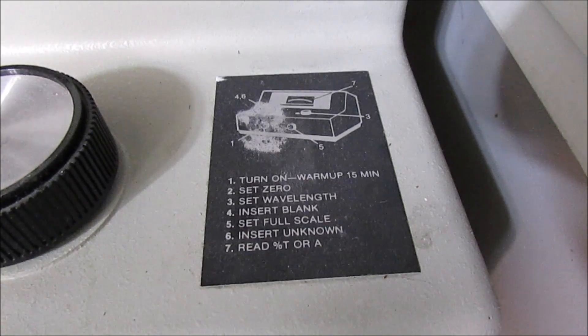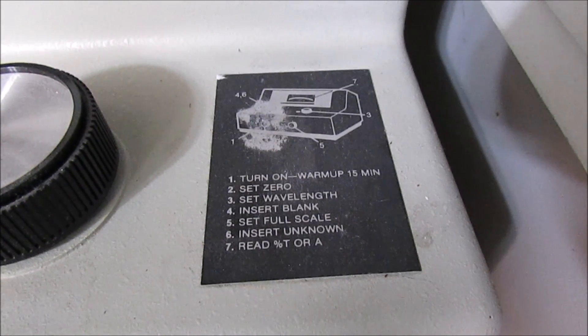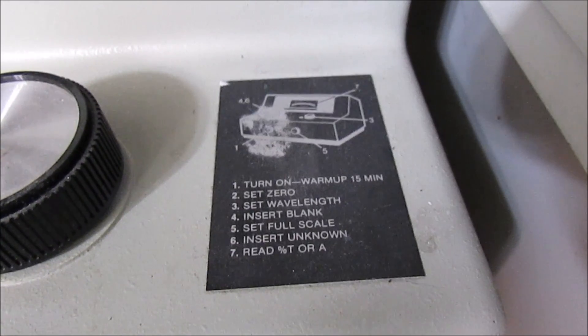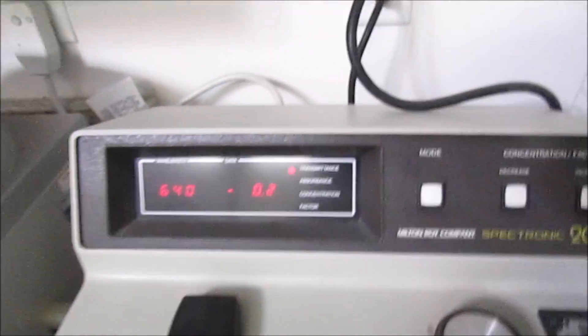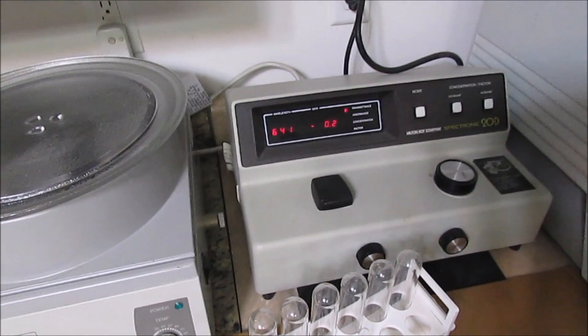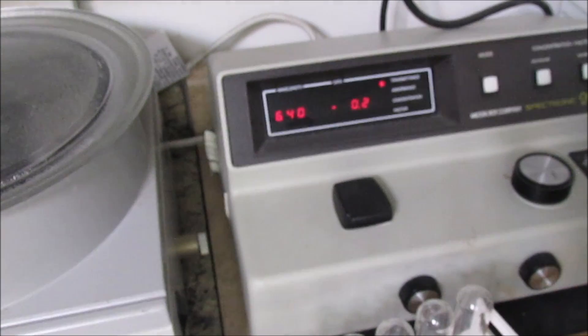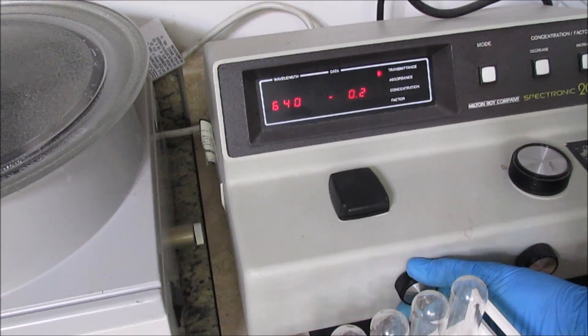Here's the instructions I'm using. I've let this thing spin on now for about 20 minutes, and I've set the wavelength for 640. Now I'm going to set the scale to zero with this knob right here.